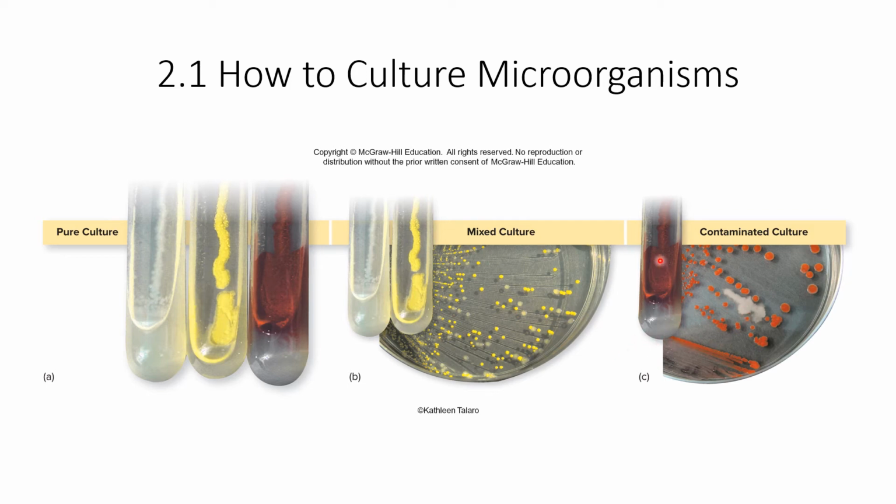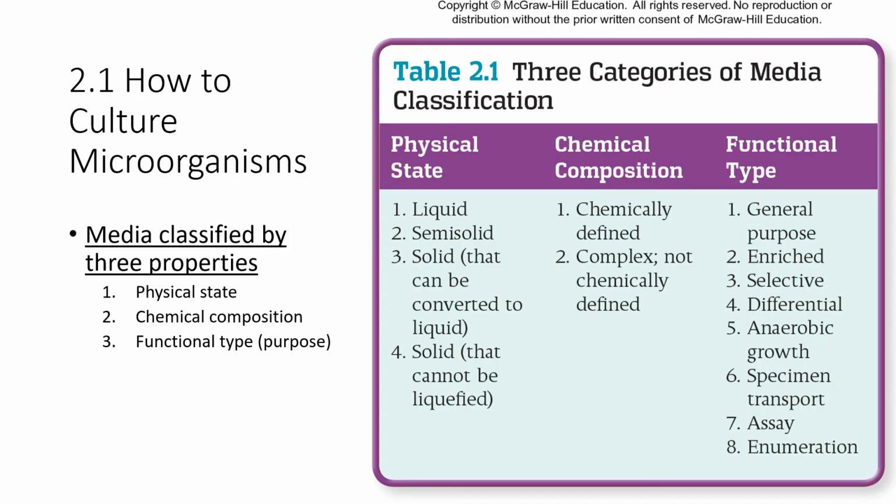We're also going to want to grow things on plates or on agars so you can test for contamination. Notice here on this, it's all red, and on the plate, the majority are red dots and just a few of the little white ones. These white ones are something new, something you don't want to be there, hence they call it contamination.